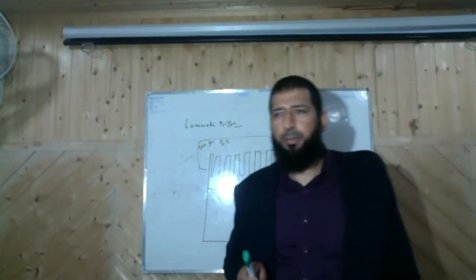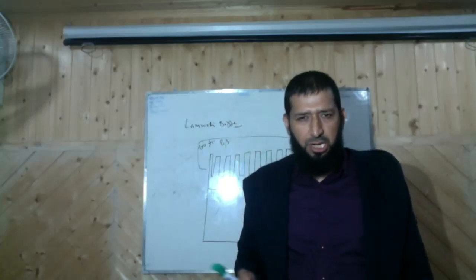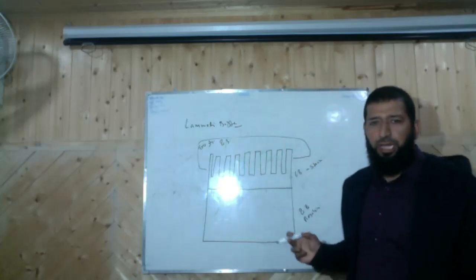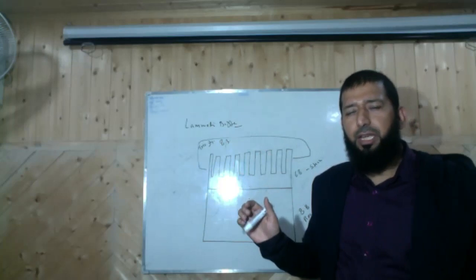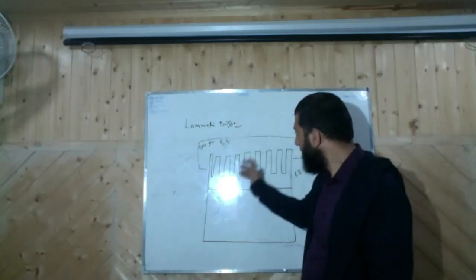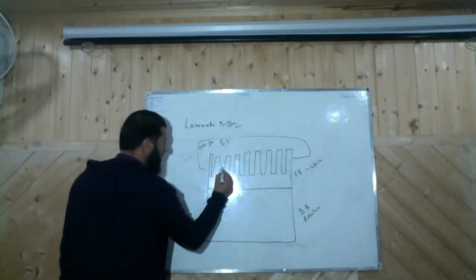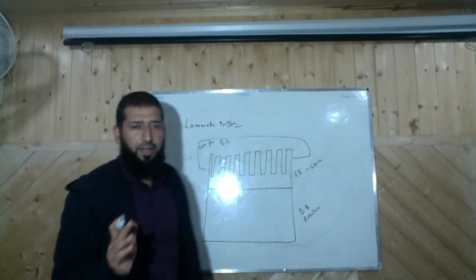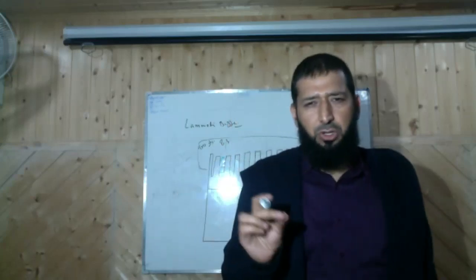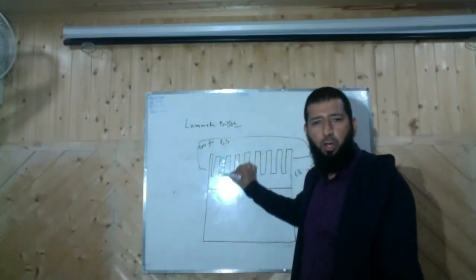So we mix our protein samples with our loading dye. Boil it so that the protein denatures fully. And then we spin it so the debris settle down, and then the clear supernatant, that's our protein and the loading dye, we take it and we load it with the help of a pipette into these wells. Depending upon the thickness of the gel, you can make a 1 millimeter thick gel, 1.5 millimeter thick gel. You can make even thinner gel, like 0.5 millimeter. So thicker the gel, more the volume you can load in your well.